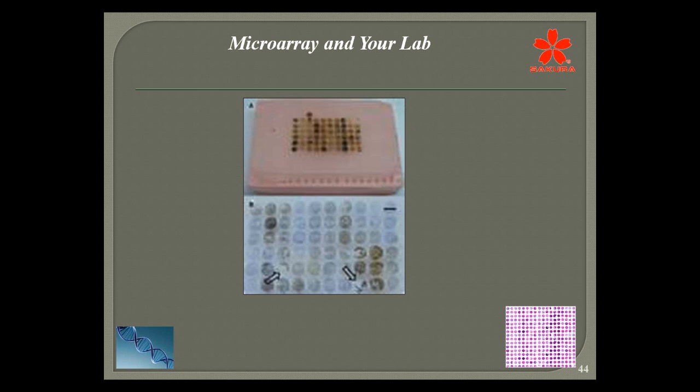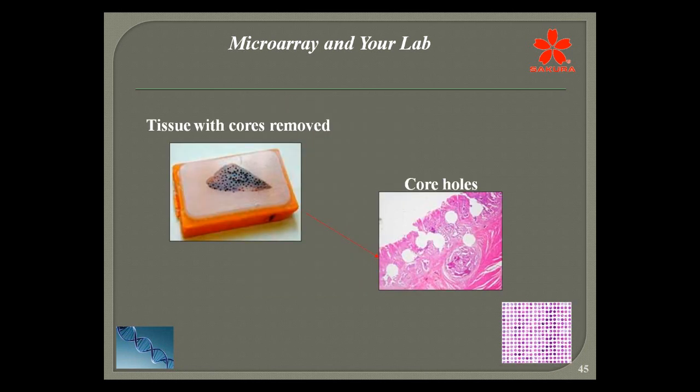This is another schematic showing you the array block. And if you'll take a look at the very top of this block, you'll see that reference point. And this person chose to have one core outside of the top of the array as their reference point. And again, that's something you can be creative and choose the area that you want to serve as a reference point.